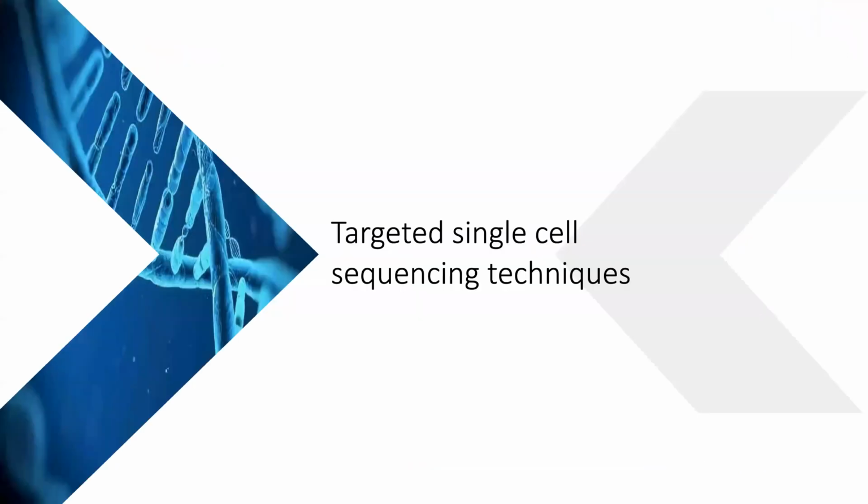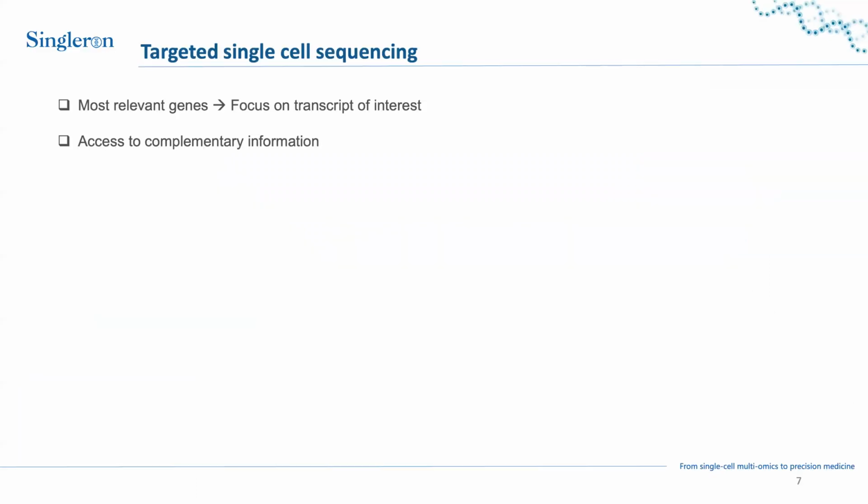So starting with targeted single-cell sequencing. Why would targeted single-cell sequencing be interesting? In many cases for research, you have very specific questions.